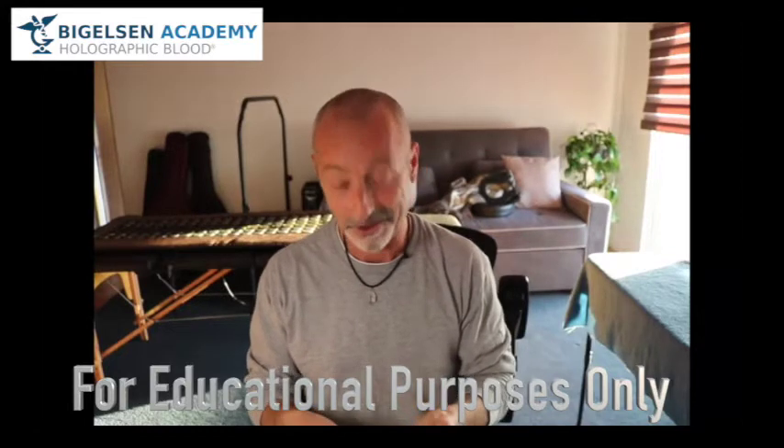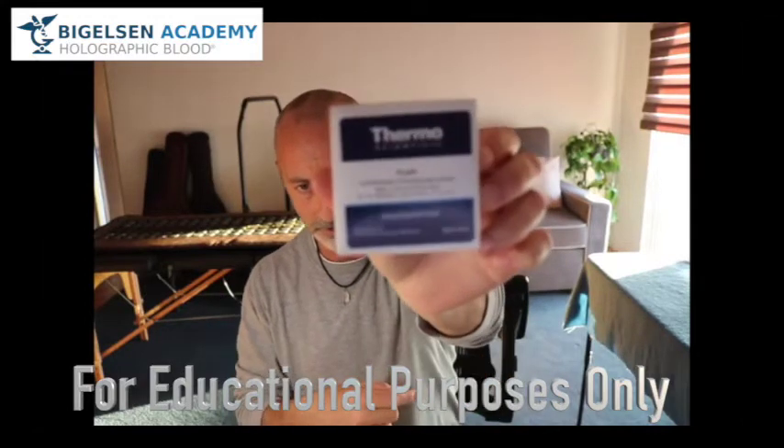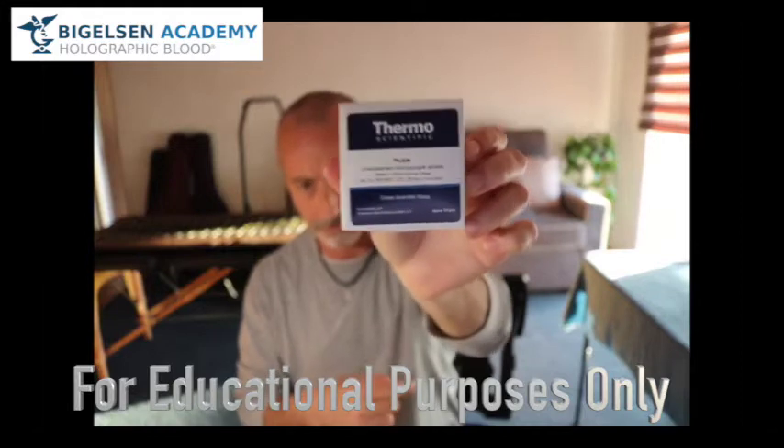Last few boxes were not the best. So unboxing — one of those cool unboxing videos. Those YouTubers have all their channels and views as they unbox stuff. ThermoScientific. It does say pre-cleaned on there. I don't know if that'll work. Pre-cleaned — it's like the video's backwards from where I'm coming from, maybe.